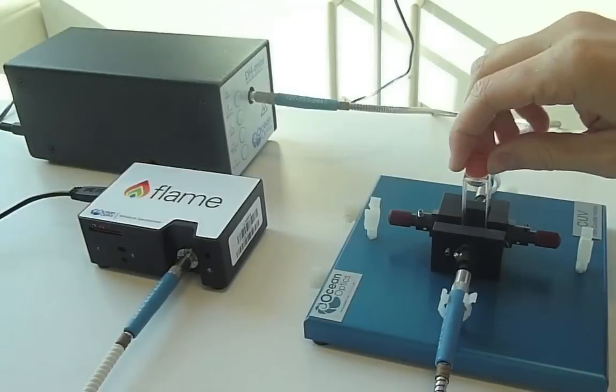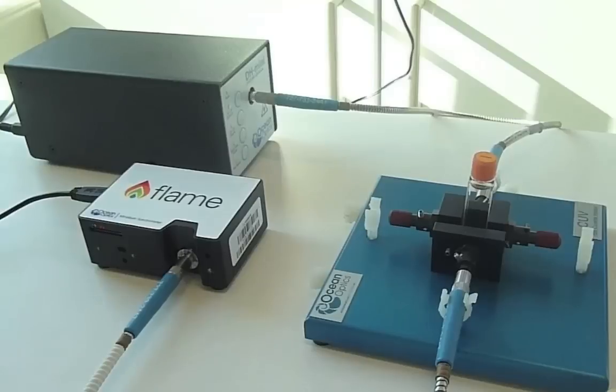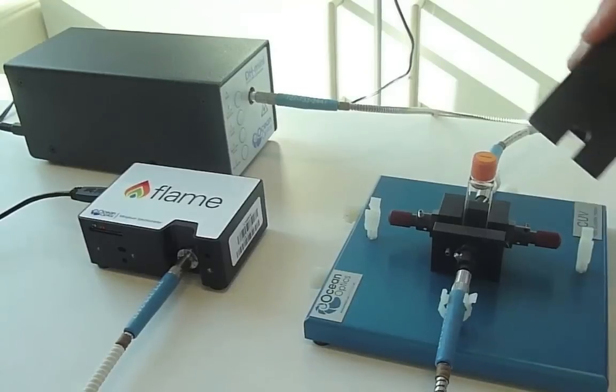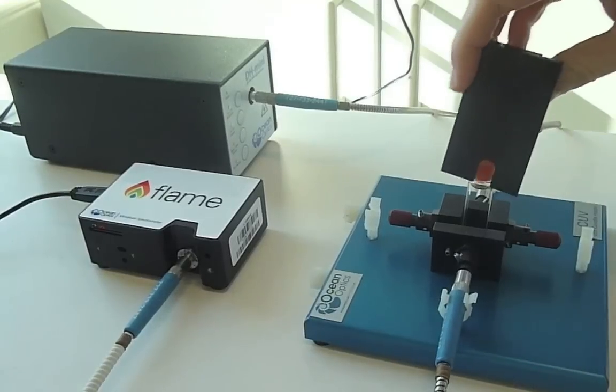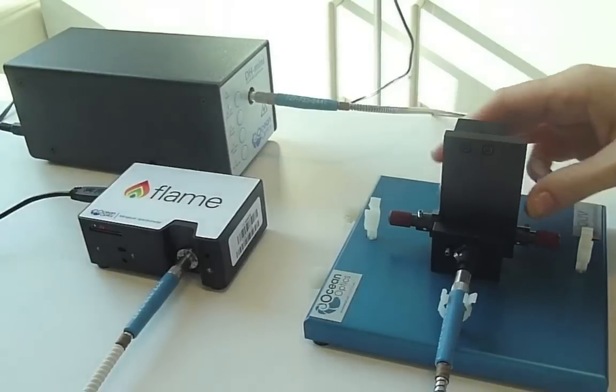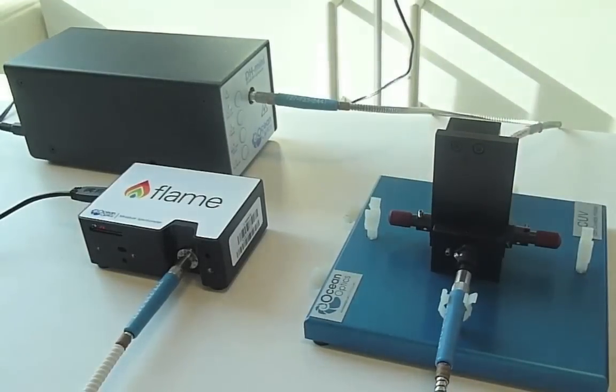You will see that a cuvette can then be inserted in line with the optical fibers to intercept the light coming from the source. This is where the absorbance happens. The CUV cuvette holder also comes with a cuvette cover that can be placed over the sample to prevent external light getting into the system.